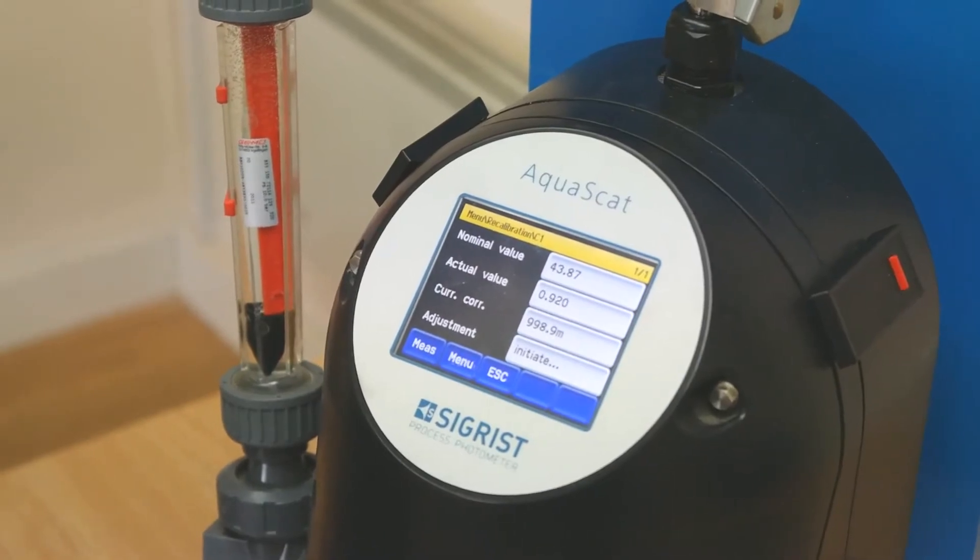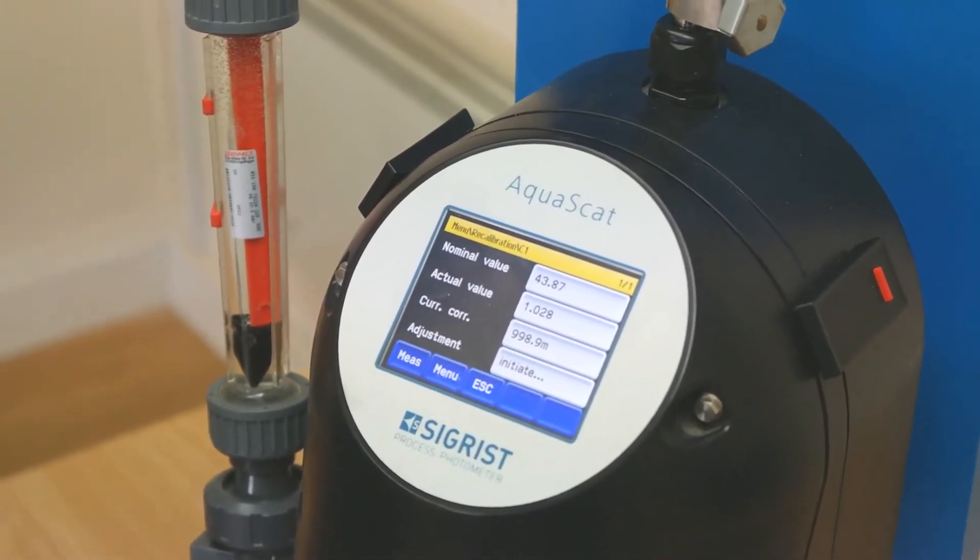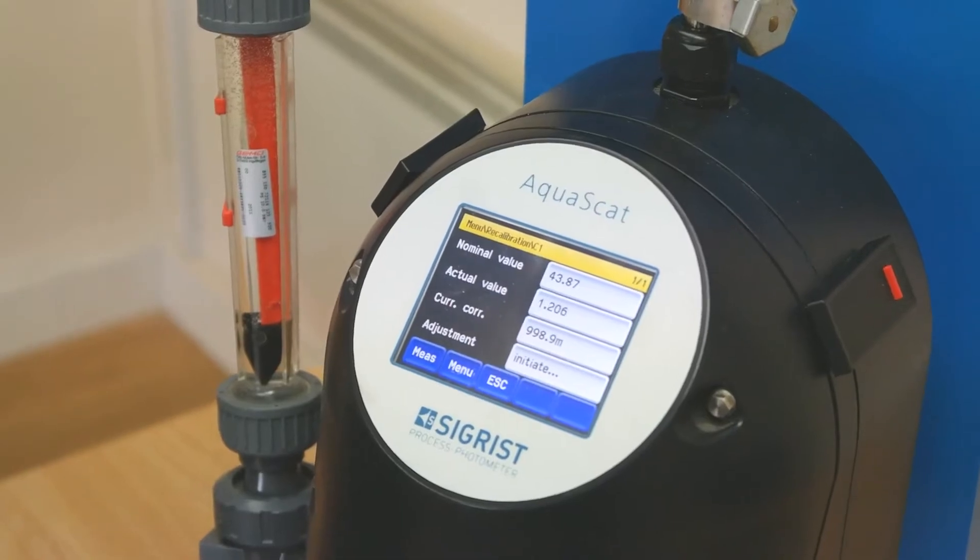The analyzer can be calibrated daily, weekly, or monthly, or at a time period of your choosing, or on demand through the menu.